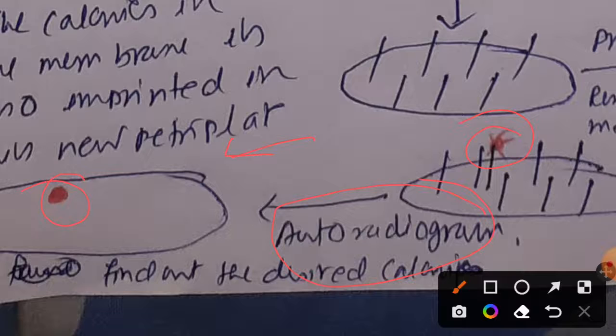That will help us to determine the position of the gene of interest, because the gene of interest is bound with the probe, right?